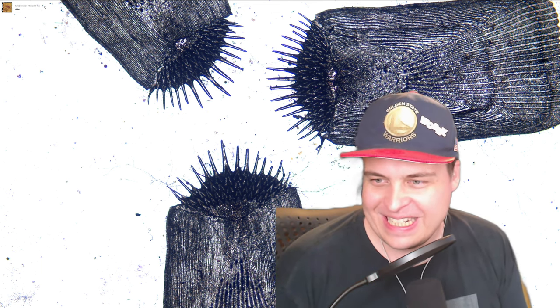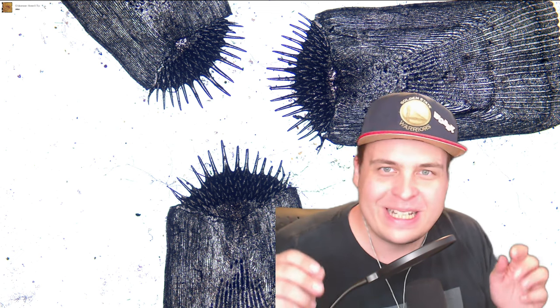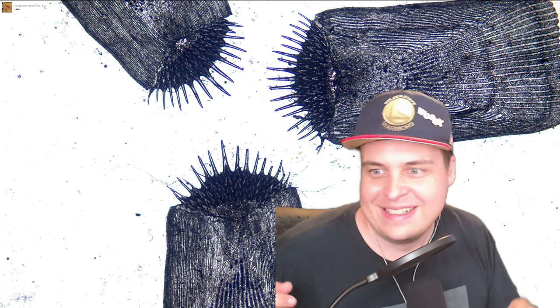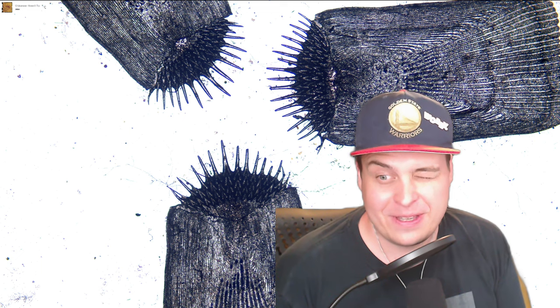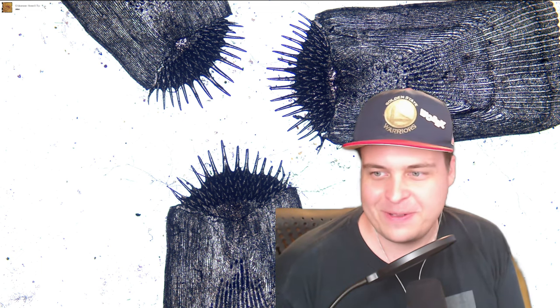I'm not gonna lie, today's stream might be a little scuffed. It might be a little short. When I was pipetting up all the plankton and getting them on the slide, I was like, oh, it's gonna be so good. I got all these cool plankton. And then I took a look at the slide and they were all dead. There's a couple I think that are still kicking, but I think there's some issue with temperature and/or salinity. Something for me to figure out in the future.